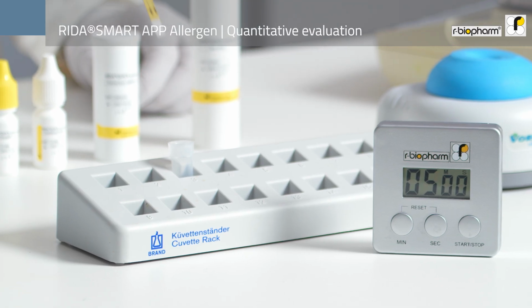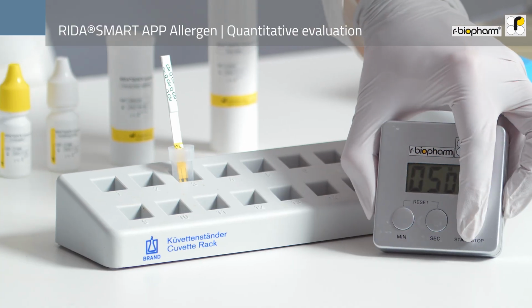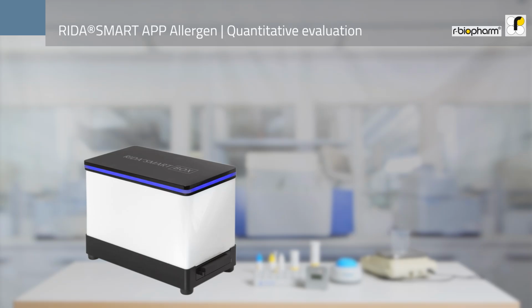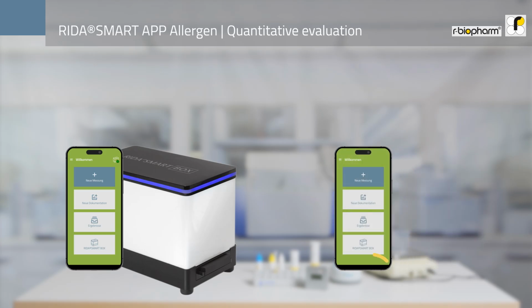After performing a quantitative RIDA Quick Allergen Quant Lateral Flow Test, there are two options to evaluate the test strip. First, evaluation can be carried out using the RIDA Smart Box. The mobile device ensures stable lighting conditions during the test analysis. The RIDA Smart App Allergen can then be used on any Android device. Alternatively, evaluation can be performed using a verified Android smartphone. Information about verified smartphones is available on our website.